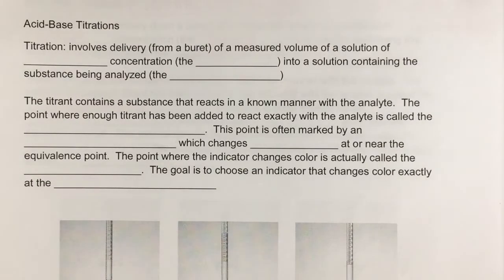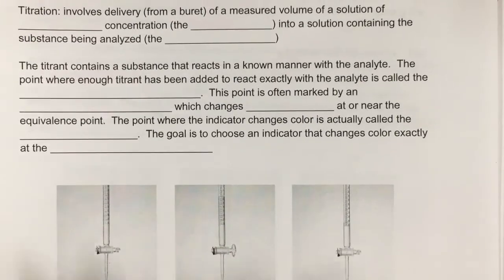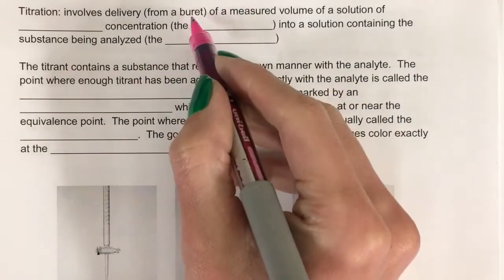So this section looks at something called an acid-base titration. Now it's important to remember that while acid-base titrations are the most common type of titration, we can actually do it with different types of reactions. Okay? Now what a titration is, I'm going to have a burette.